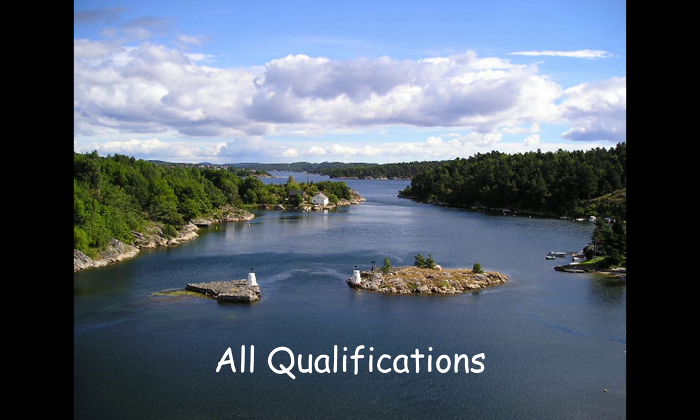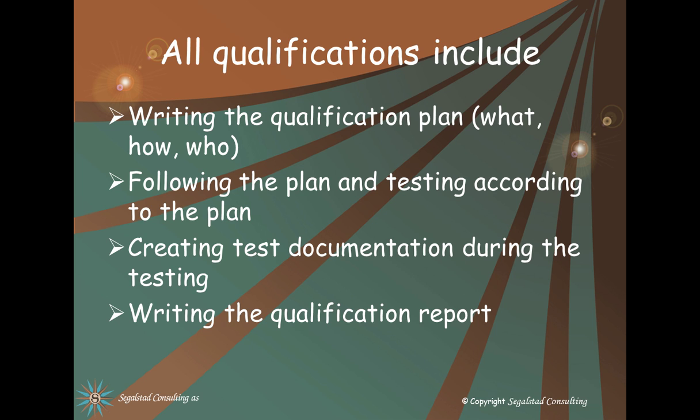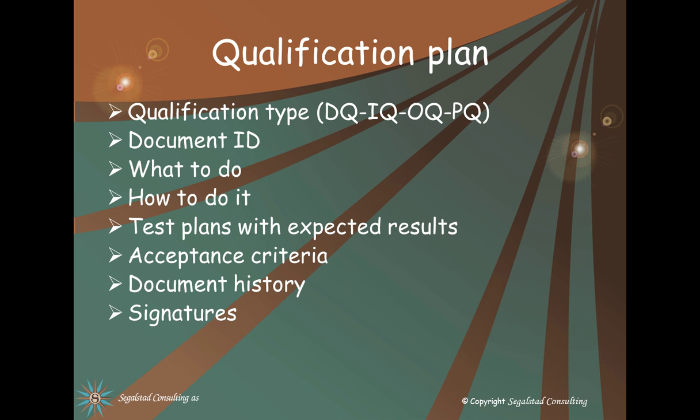I'll talk more about each of the qualifications, or actually not each of them, but more like what we do with all of the qualifications. All of them will include writing the qualification plan, what to do, how to do it, who will do it. We will follow the plan and test according to the plan. We will create test documentation during the testing, and we will write the qualification report.